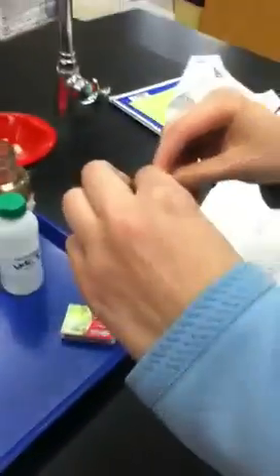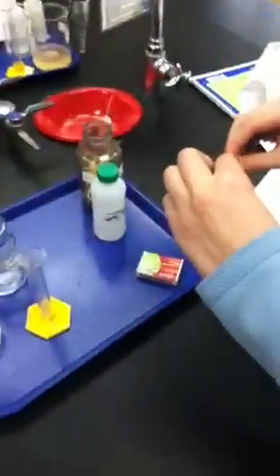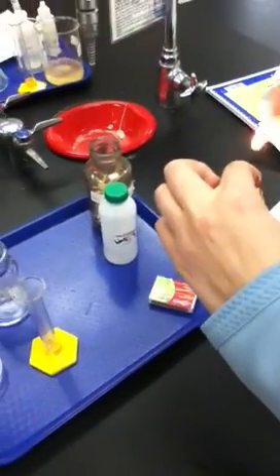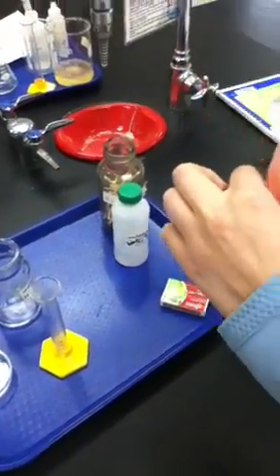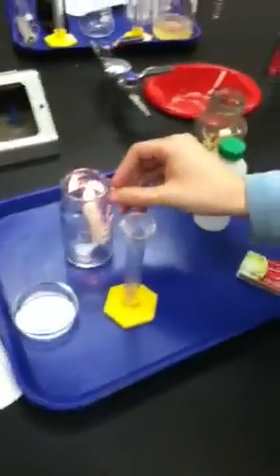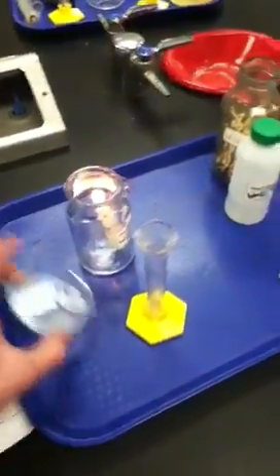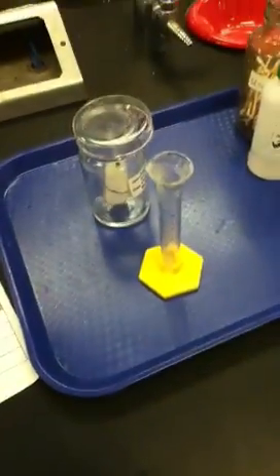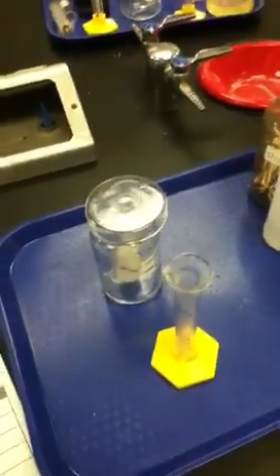So now she's lighting the match to light the candle. Now she's lowering it into the container and light is produced — it's a change of state because it's turning from a solid to a gas.